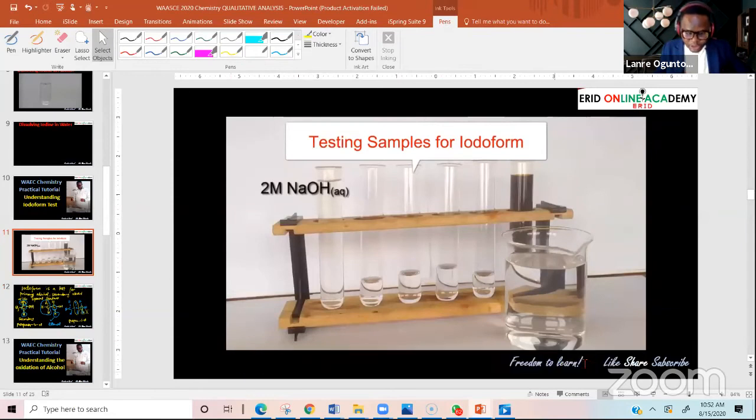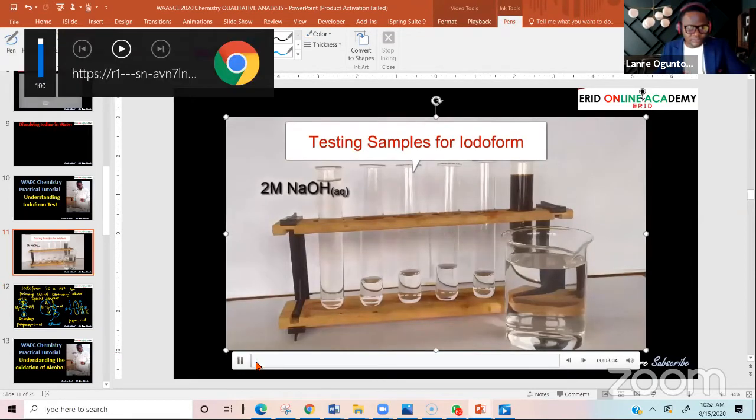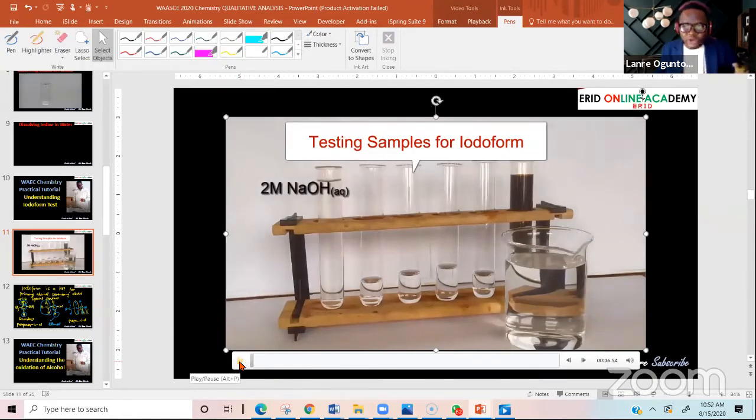I need you to be observant. This will show you, interestingly, it's about 6 minutes. So I need you to watch the laboratory application. Okay, so let's start. Theoretical background for the formation of triiodomethane. Can you hear the sound in the video? I want to be sure.